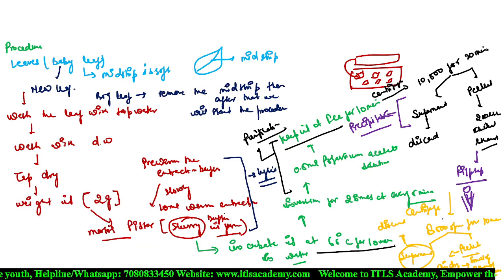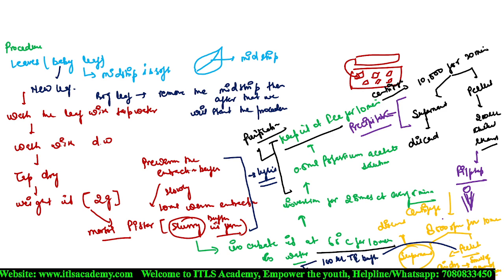When the smell of the ethanol is removed, add 100 microliter of TE buffer and incubate it at 65 degrees Celsius for 1 hour in a water bath.